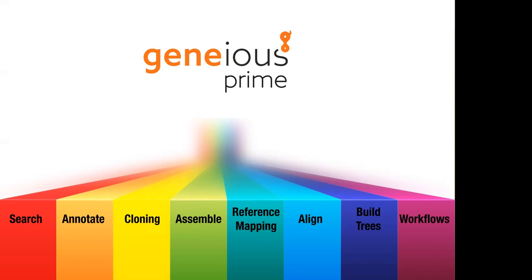There's lots of different tools for cloning. So Geneious will do primer design. It will create primers. If you have a library of existing primers, you can import them into Geneious, see if they match against any sequences.